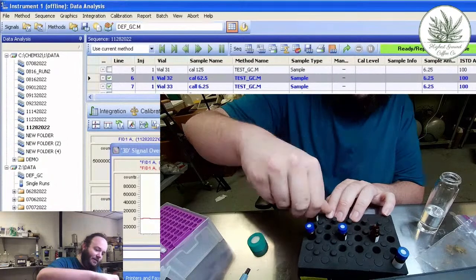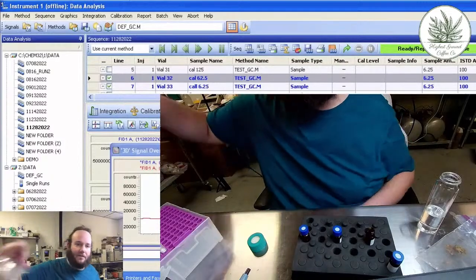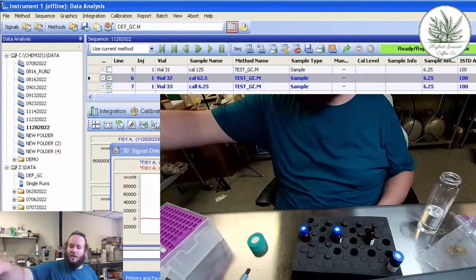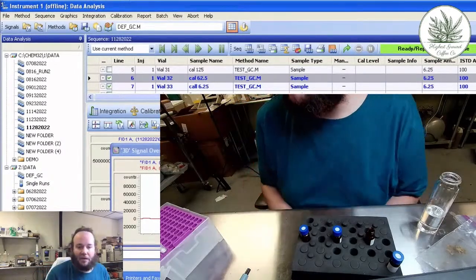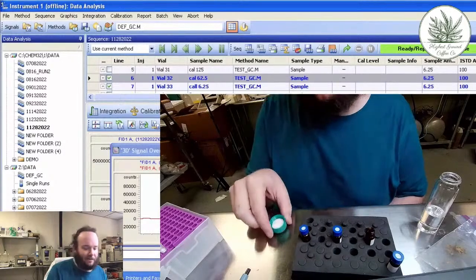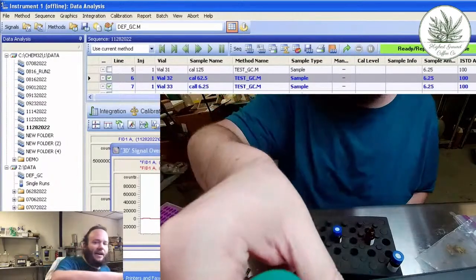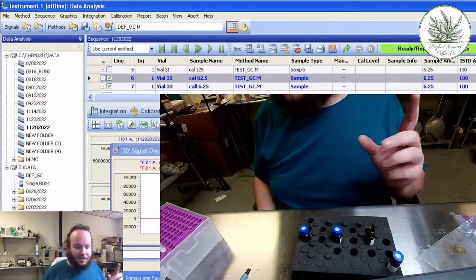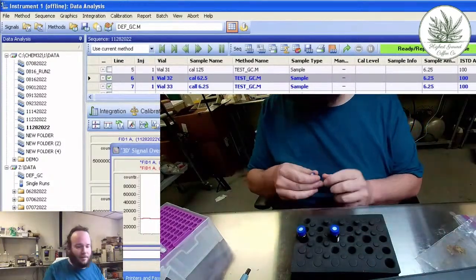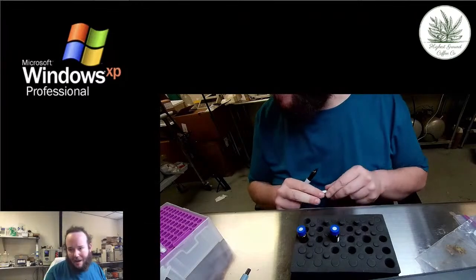All right, so the last thing for this part of it, I'm going to take this out because I'm going to put this back in the freezer, lest it escape through evaporation. Joshua, we're not testing any formulations today necessarily anyway. We are finishing up our round of plant and flower testing from yesterday. So all we need to do now is rerun the calibration so that we have a good calibration set. And then we'll be able to basically run the math on it.